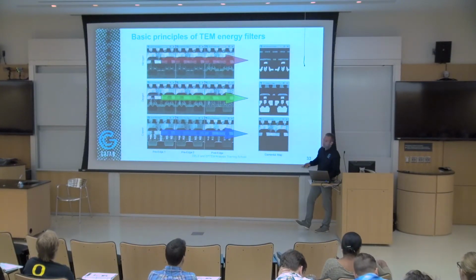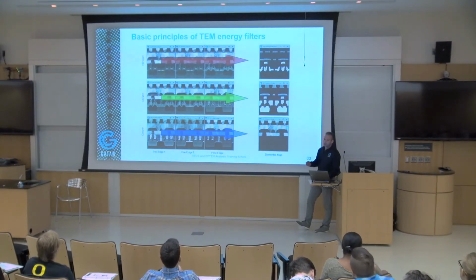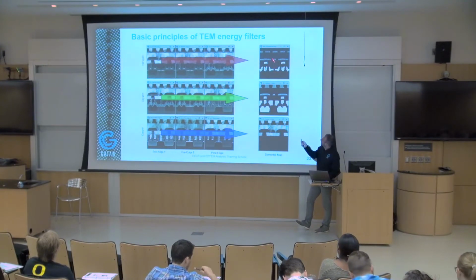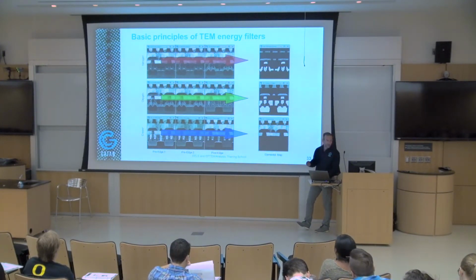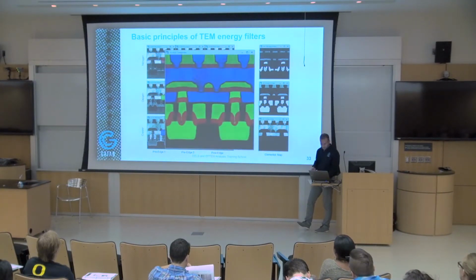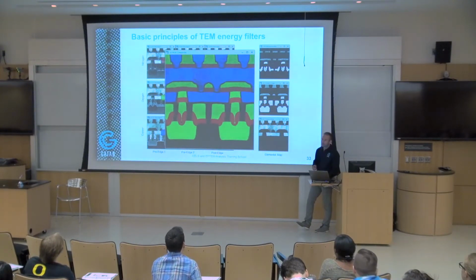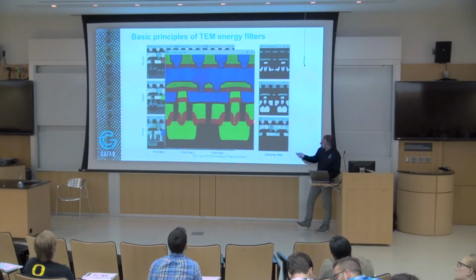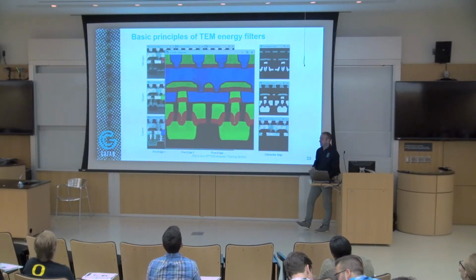We call this image a map because the intensity is proportional to the absolute amount of that particular element in this particular region. So essentially, you can convert this intensity map to compositional maps. You can put everything together, you get colors. The good advantage of EFTEM is, first of all, that you're in TEM mode, so you don't need STEM. That could be a big advantage, especially for beam-sensitive materials that can't stand the intense probe. So you can do everything in TEM mode. You can also, in a relatively short amount of time, get information from a very large area of your sample.